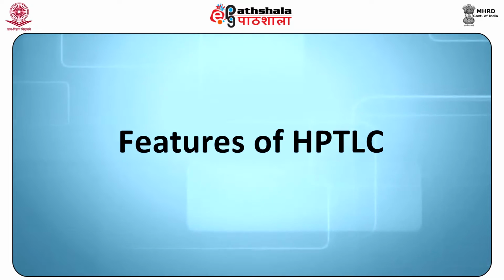Features of HPTLC: technically, it is easy to become skilled at and operate, several analysts can work simultaneously on the system, and there is availability of a wide range of stationary phases with selectivity for mixture components.